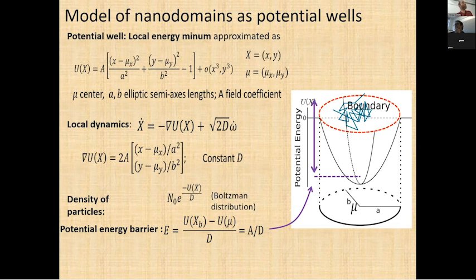So if you know the diffusion coefficient, which you can get because you look at second order properties, then you can get all the information of interest that would characterize the energy of the interaction between your well and your receptor, or the quantity of interest. And you can even infer from this the stability by calculating what is called the escape time. That is, on average, how long it takes for a trajectory to escape.